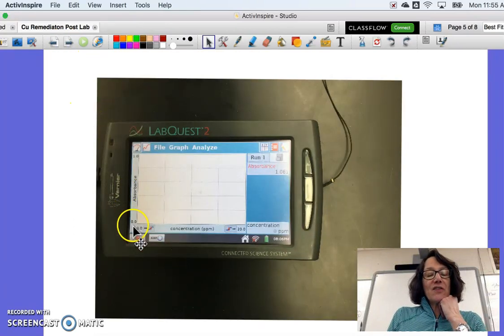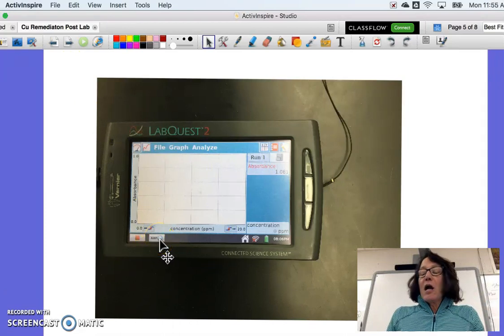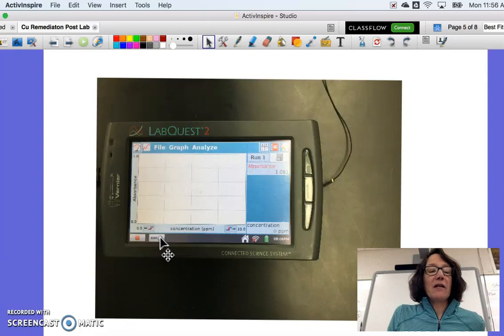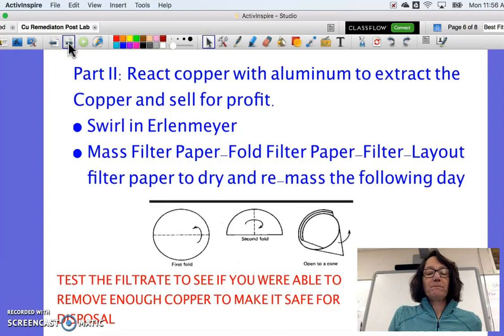So the minute I hit start for my data collection, this keep button will appear. I don't stop data collection in between my trials. When I put a certain dilution into the colorimeter and the absorbance reading stabilizes, I simply hit keep, which means it's going to lock in that absorbance value, and a little dialog box will pop up where I can then tell it what that corresponding concentration was.